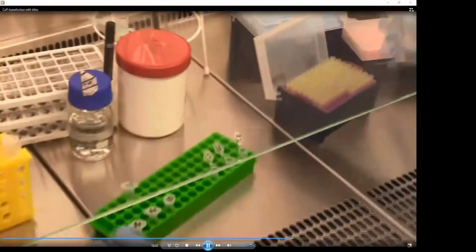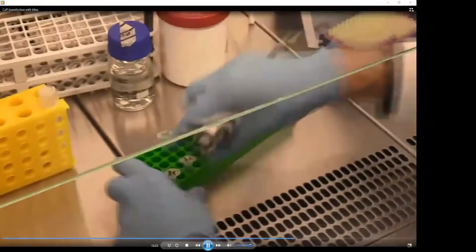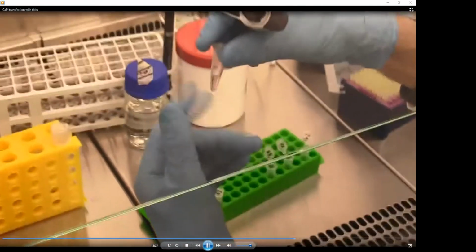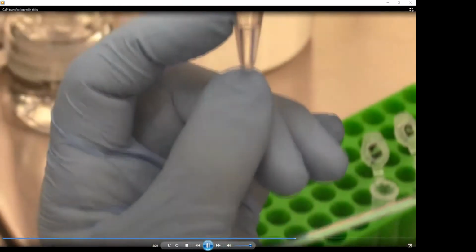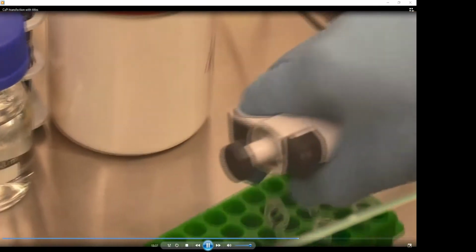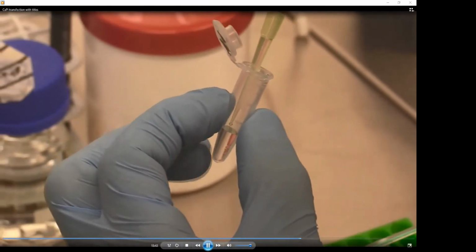And the next part is to pipette it really always 15 times. The point is the best formation of the complex and the reproducibility. So you have to collect all your mixture of DNA calcium chloride and then add it to HBS, once again dropwise.